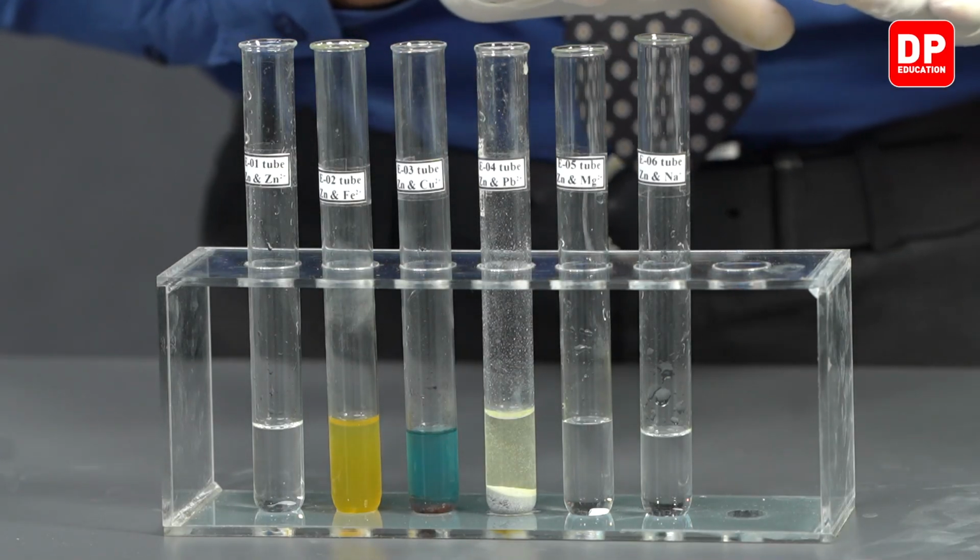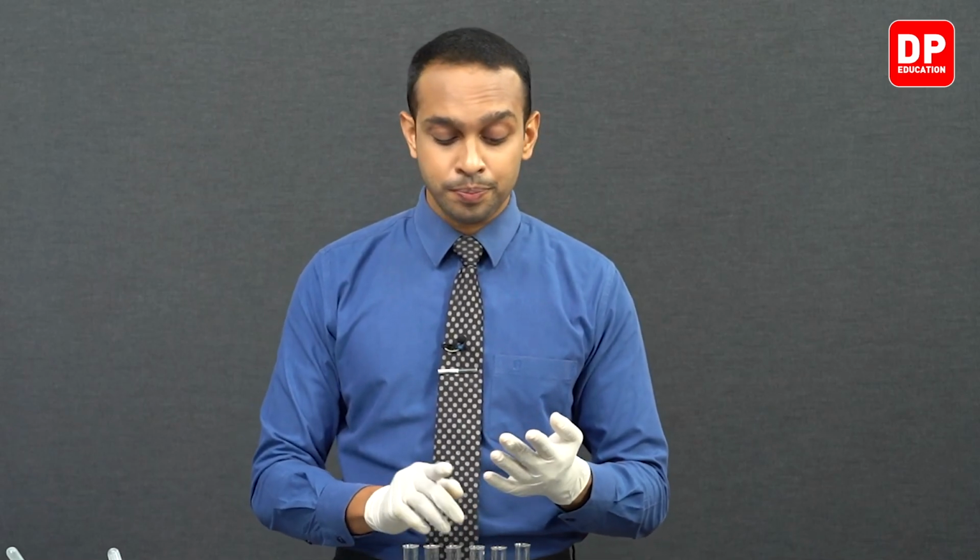So now let's go over the reactivity of zinc. Out of the 6 solutions, 1 solution was Zn2+, so we can disregard that because we know very well zinc metal cannot displace its own Zn2+ ions. Apart from that, there were 5 other solutions: Na+, Mg2+, Fe2+ or ferrous ions, Pb2+ and Cu2+.